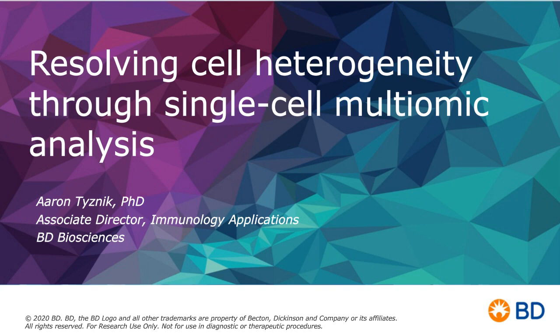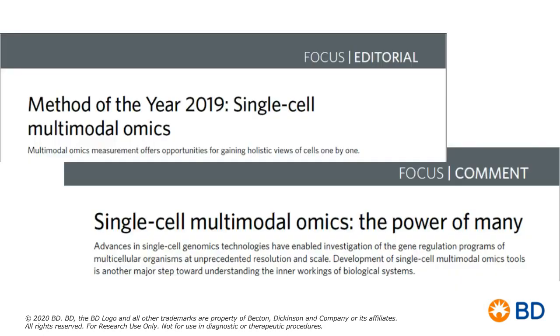We typically capture upwards of 95% or more. But what I typically refer to is the stacked yield, meaning once the cells have gone through the entire assay in its entirety, what winds up being sequenced. Officially we say greater than 65%, but what I see in practice is much more along the lines of 75 to 80%. And again, this is determined by a number of factors, for example, cell viability and cell size.